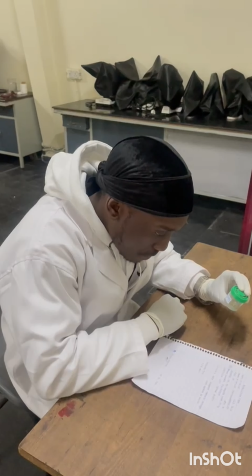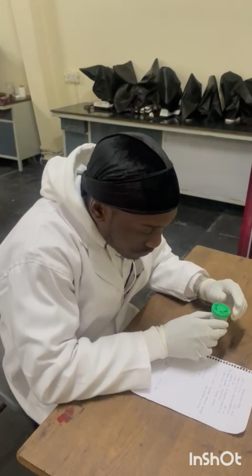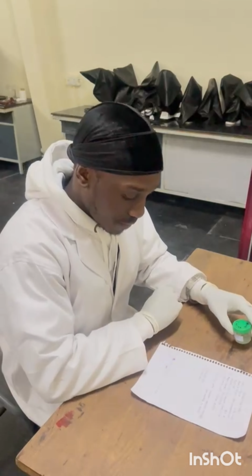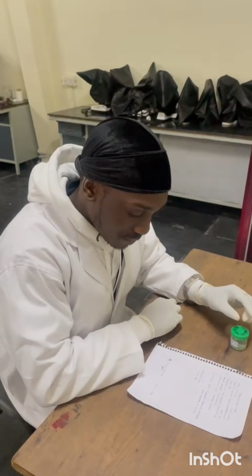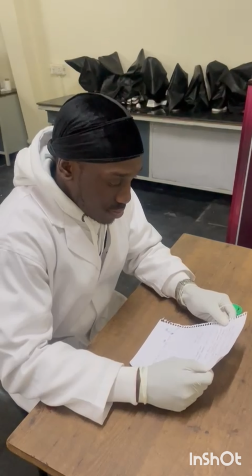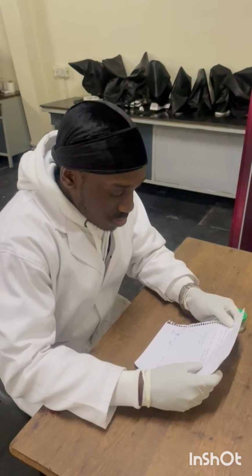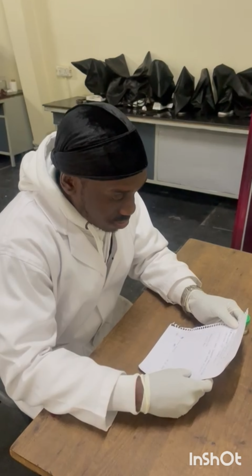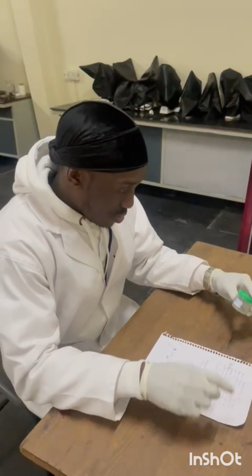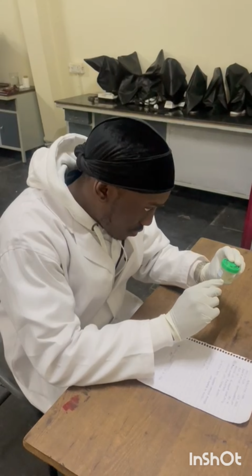Sample reception. Sample reception is a process of receiving, inspecting, and documenting biological specimens such as fluids, tissues, or cells in a laboratory setting. It is the initial step in the laboratory testing process and involves verifying the identity and the integrity of the sample, as well as ensuring that it is properly labeled, stored, and handled.